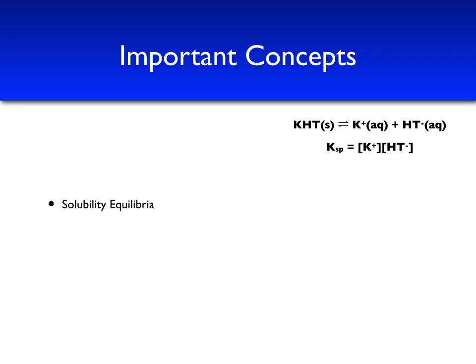We note that the ion product is only a constant once the solution is saturated, which implies that both solid and the aqueous ions must be present.